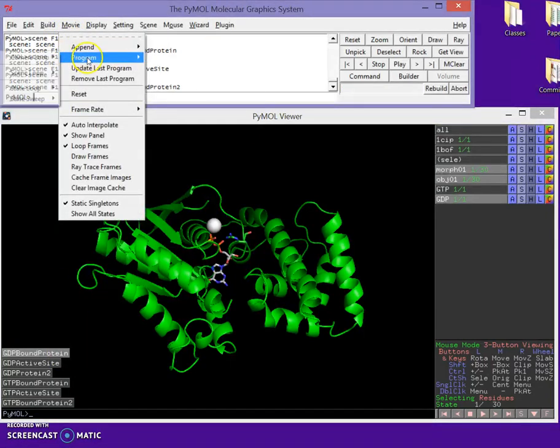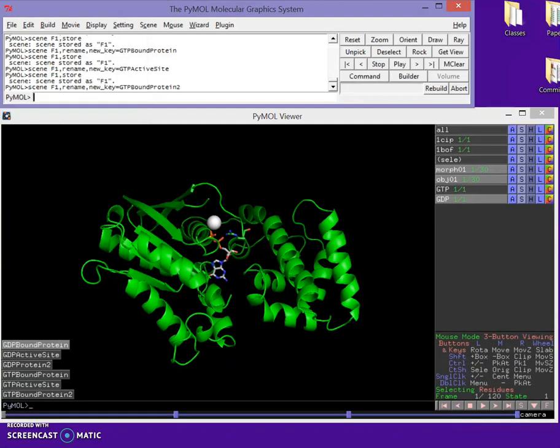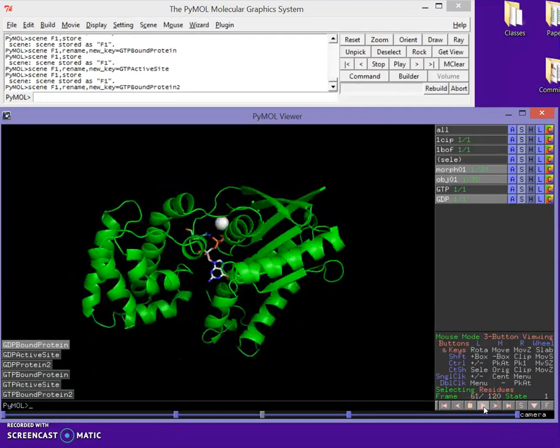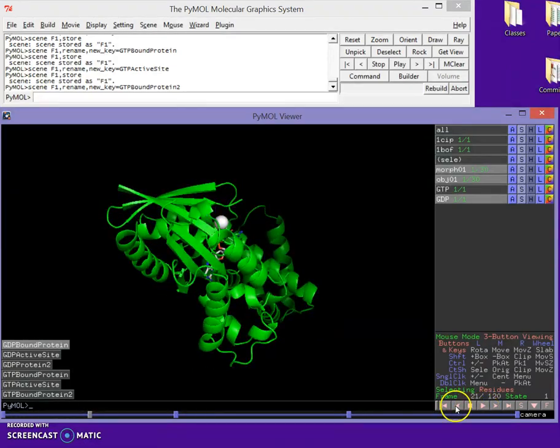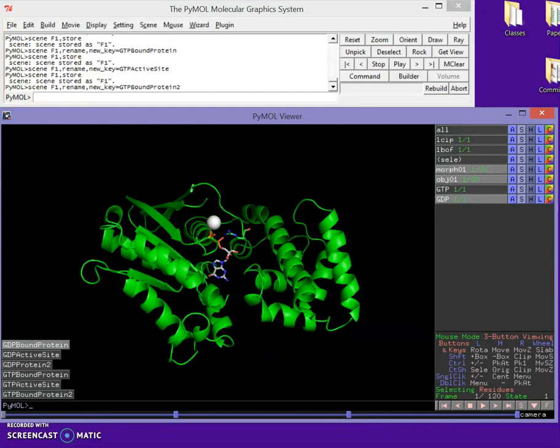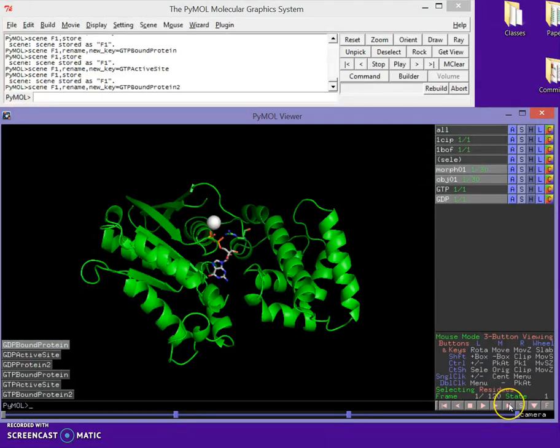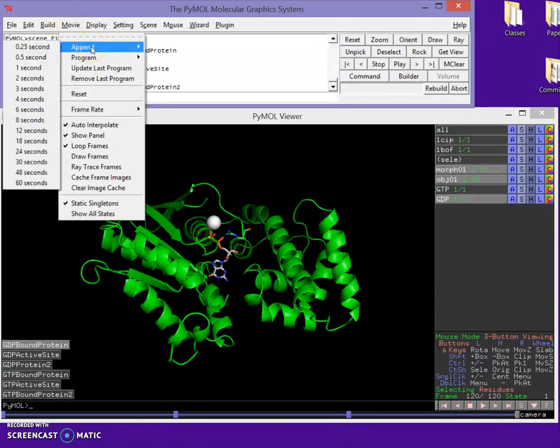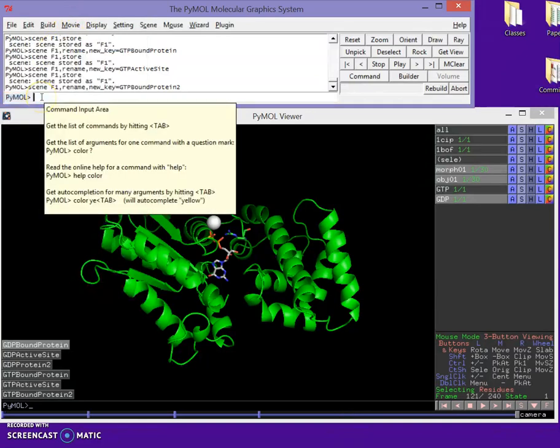I'll go back to our first scene and program the movie by going to Movie, Program Camera Loop — this moves the camera all around — and I'll select a 4-second Y roll. When we play the movie we'll see a spin around the Y axis. Then I'll jump to the end of the timeline — we're at frame 120 out of 120 — and go to Movie to add four more seconds, giving us additional time for the next part.